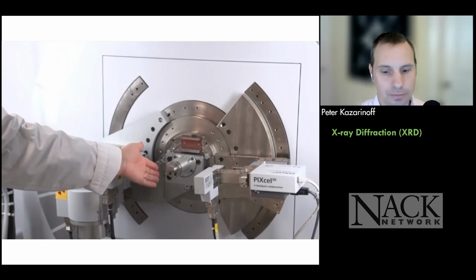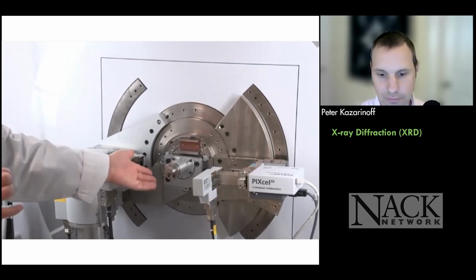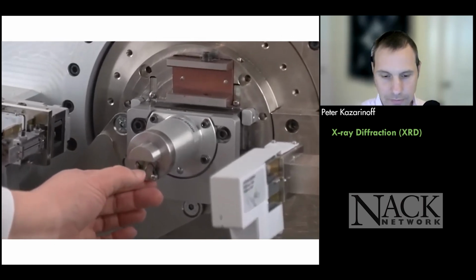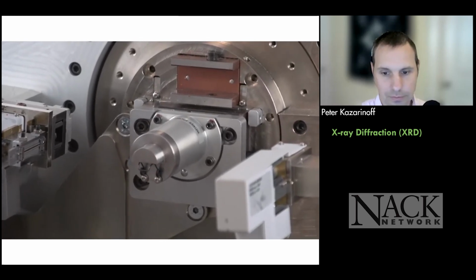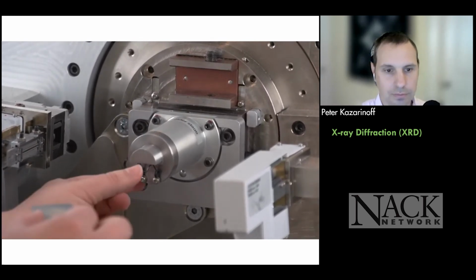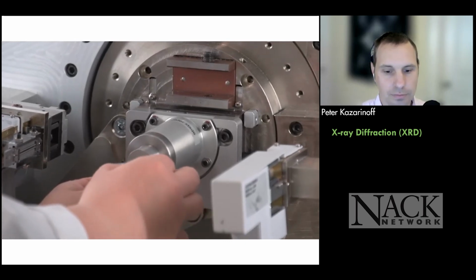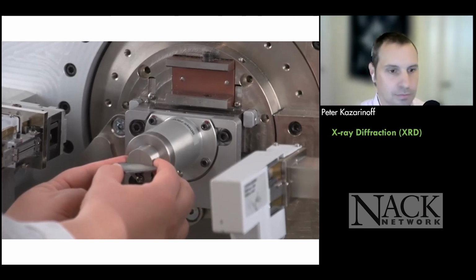Right now I have installed on our instrument what we call the flat holder or the flat sample stage. Very simple device. It's basically just a little clip that's spring-loaded. And I'm going to take my sample that I prepared and insert this by pulling down on the clip and putting the sample holder in at an angle like so.